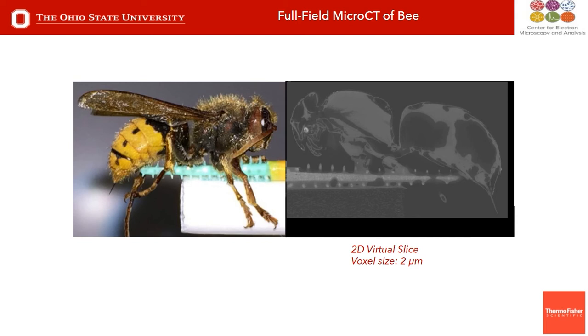She likes to look at honeybees. And this is not exactly a honeybee, but if you're working on insects, just as I alluded to the African hornet, one scan of this shows you the entire structure of the hornet or the bee. And so you may have a defect you're looking for in a bee. Maybe not every bee has whatever it is you're looking for in it. And now you could use this scanning method to actually identify the exact bee that you're looking for. Maybe there's a deformity in the torso, right? So remember, it allows us to non-destructively see into our material, whatever it is we're looking at.